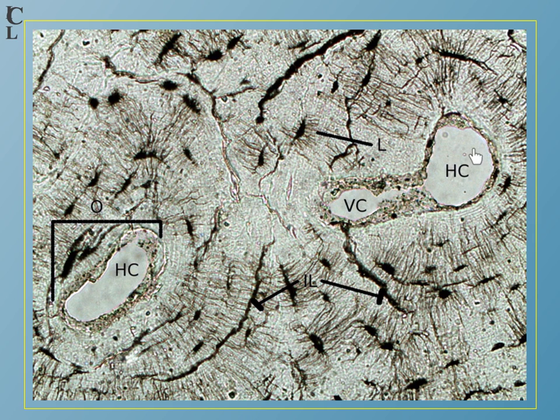Because we don't mention any living tissue in this slide, we have Haversian canal, calcified tissue. We have Volkmann's canal, calcified tissue also. And these are the lacunae, and these are the canaliculi. Also Haversian canal, and here all of this structure will be the Haversian system.